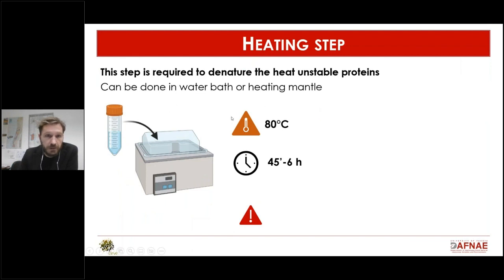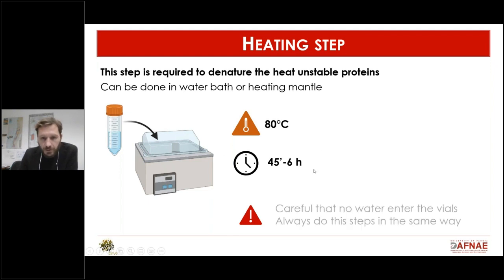You heat it up by using a water bath or a heating mantle. The temperature, as we said, is typically 80 degrees in most of the tests, but there are some variations, 45 minutes or 30 minutes to 6 hours, depending on the test that you choose. But even this step is critical because it's important that, for example, no water goes into the vials, and also that the step is always done in the same way.